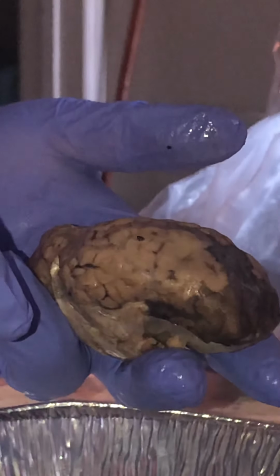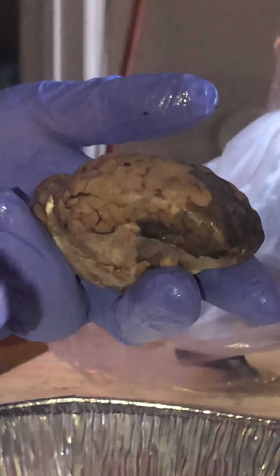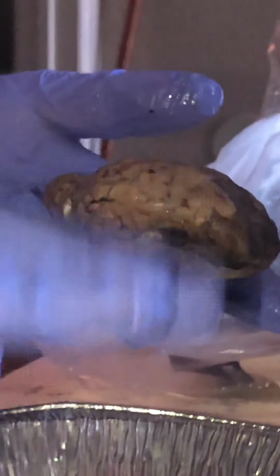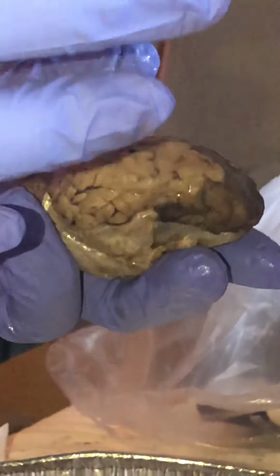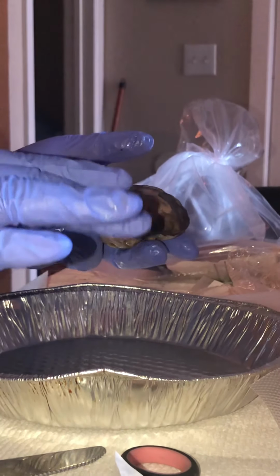Okay, so back to the sulcus and the gyrus. For the cortex, the brain goes up and down. The one that goes deep in is the sulcus, and the one that comes up out of the cortex, that's the gyrus. The function of those is to store information and send information, with dendrites and stuff like that. I believe. So let's keep going, and if not, it'll come back to me.